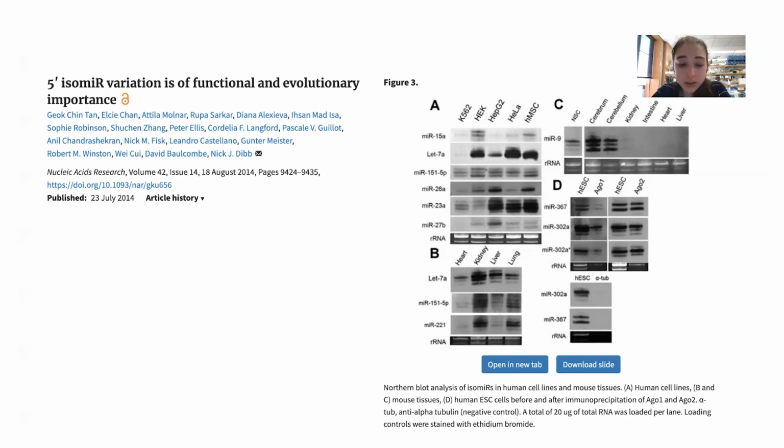So there's a couple problems with trying to do an RT-PCR on small RNAs. One is that they're really, really small, and so basically they're the size of your primers. And so how are you going to copy them? Often this is done by making specific adapters, and there are various things so you can make copies of the region, but then you risk losing some of what was there.